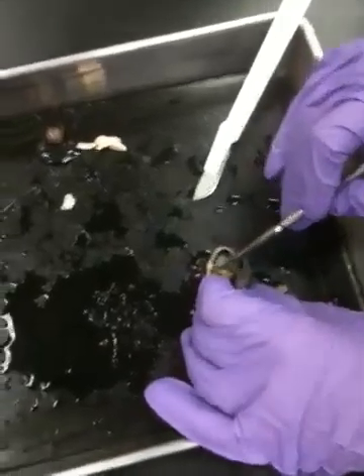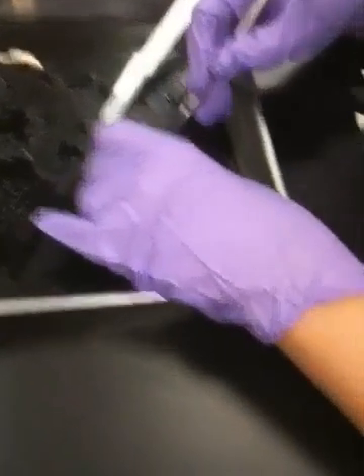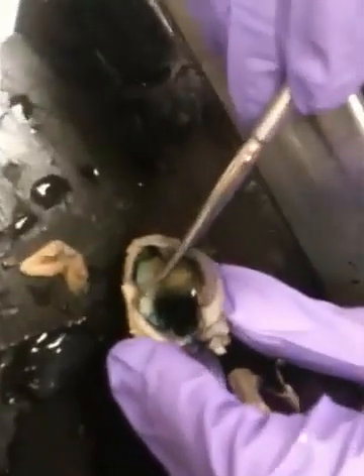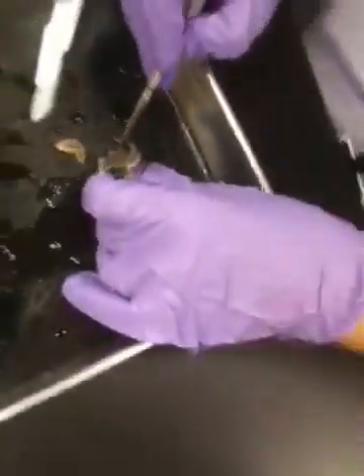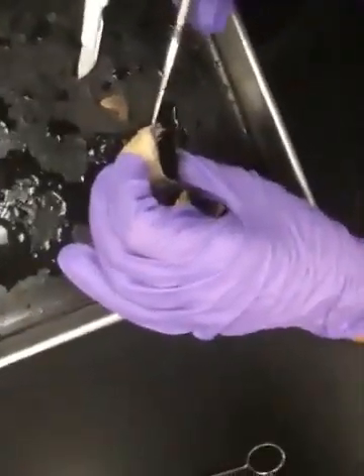part of them is processing out towards the back. So in order to do it, I have to scrape pretty hard to get that off. So now we can completely remove the retina, and you can see half of the optic disc here. So it's going to be the part of the choroid that's going to look yellow as opposed to dark because it doesn't have the choroid material there. And you can always make sure that it's the optic disc because you can look over on the other side and you can see the optic nerve.